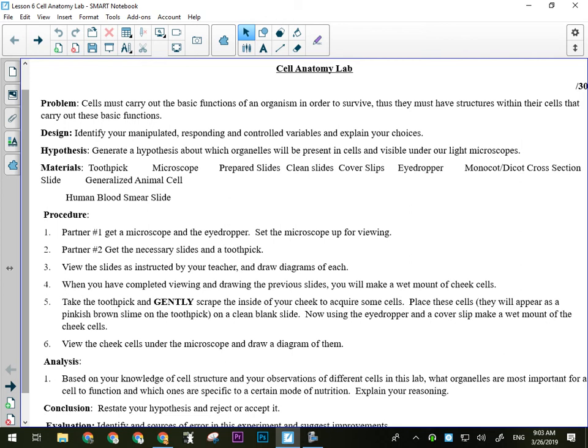Okay. All right. Few things that we want to make sure we do. We want to look at all of these cells under high power magnification. Okay, we want to make sure of that so that we have a fair comparison between all of the organisms' cells. Okay, you know, kind of same lighting and all of that kind of stuff.